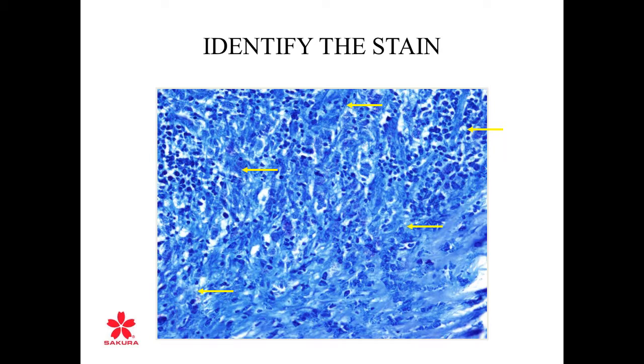We're going to talk about that a little bit later. One of the main concerns a histologist would have if they're looking at this is that the background staining is so dark, so heavy, that it's masking out whatever staining entities are there. Thus, the explanation for microorganisms: because they're so small and minute, it is very easy to mask out the specific organisms by the counterstain, or if the stain is not done optimally. And if you cannot identify them, then you cannot look at the morphology and you cannot make an exact assessment of specifically what type of microorganism this is.